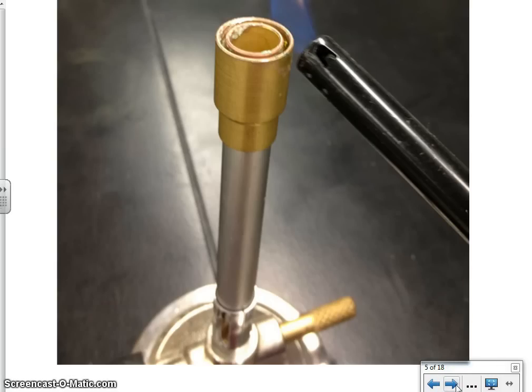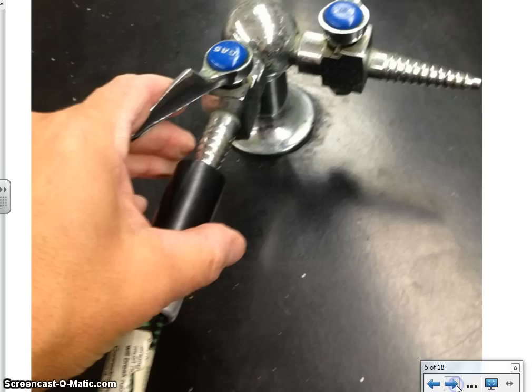Once you have the lighter in that position, then and only then will you turn the gas jet on. You'll turn the gas jet on by taking the silver handle and bringing it forward so that it is close to the actual gas jet right here. So full on would be when the handle is directly over the gas jet itself.